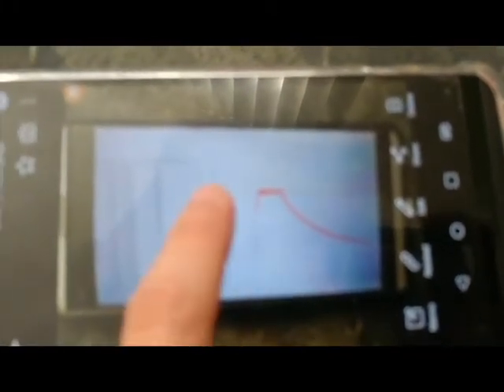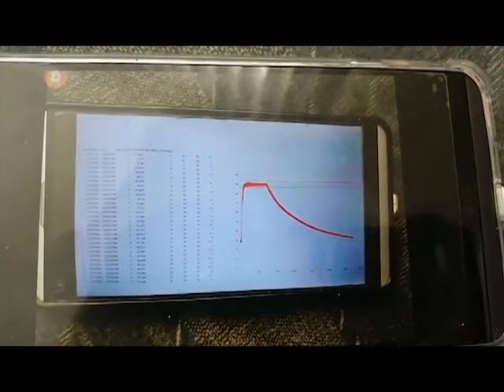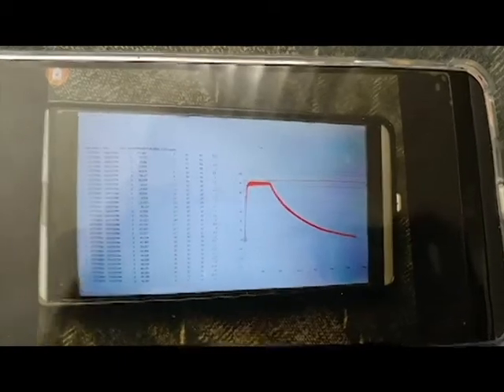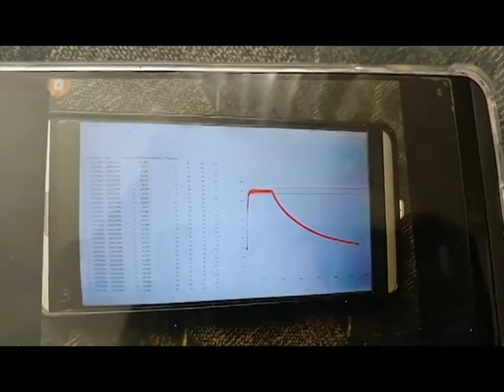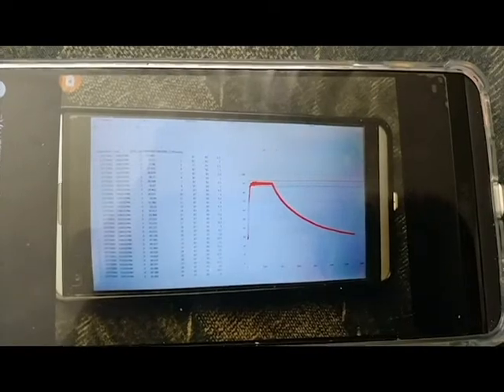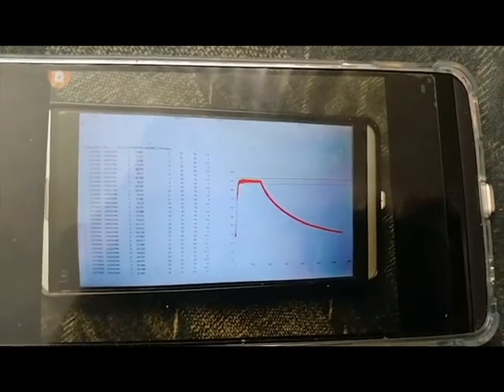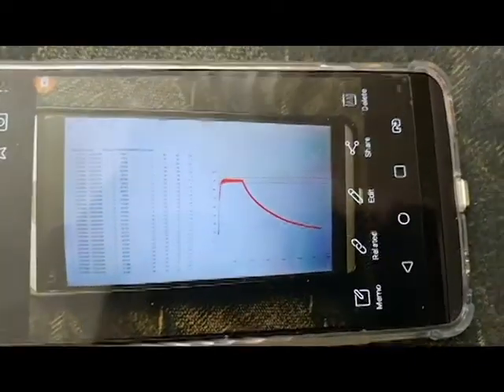I want to add more that being a vacuum oven, the interior chamber is completely sealed. And when it's in vacuum, I'm thinking the only way the sample will get heat is by radiation, kind of like in space. That's why it takes a long time, and that's why even after turning off the heat, the temperature will keep overshooting beyond the set point.